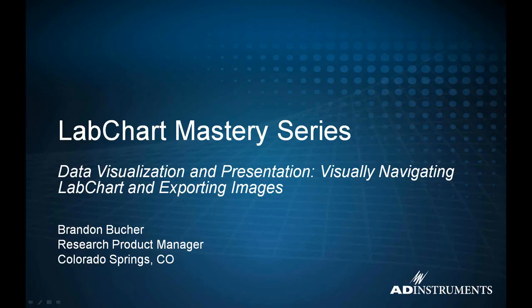Today we're going to be talking about data visualization, or visually navigating LabChart and exporting images. So what we're going to talk about today essentially is how we look at LabChart, how we change axes, how we change the way LabChart works, and how we make it work for us during our recording or during our analysis. So that's a little bit about the topic we're going to get into today.